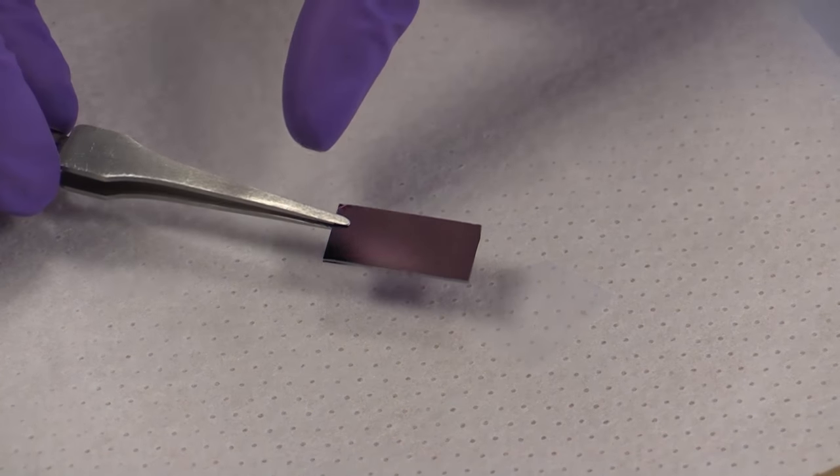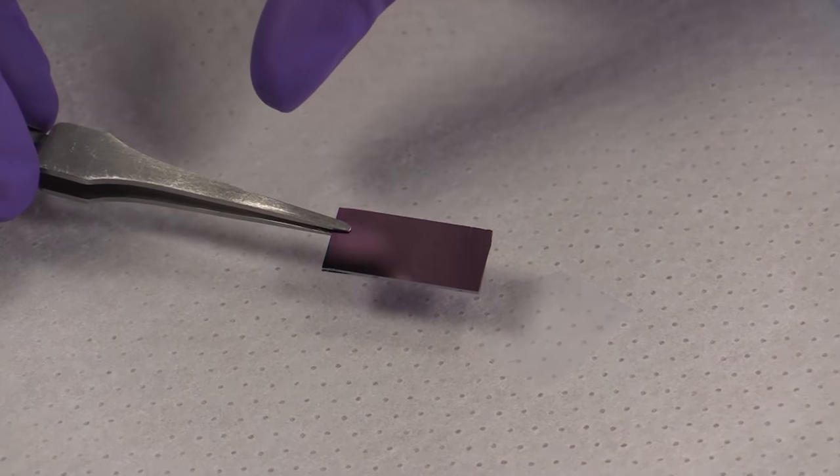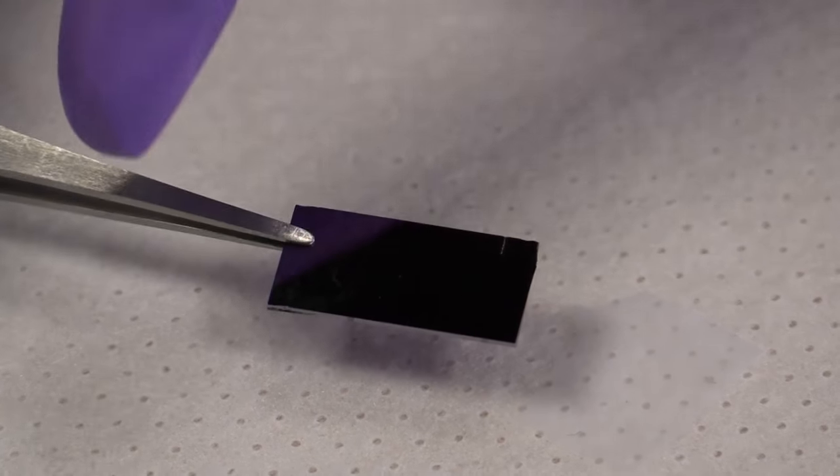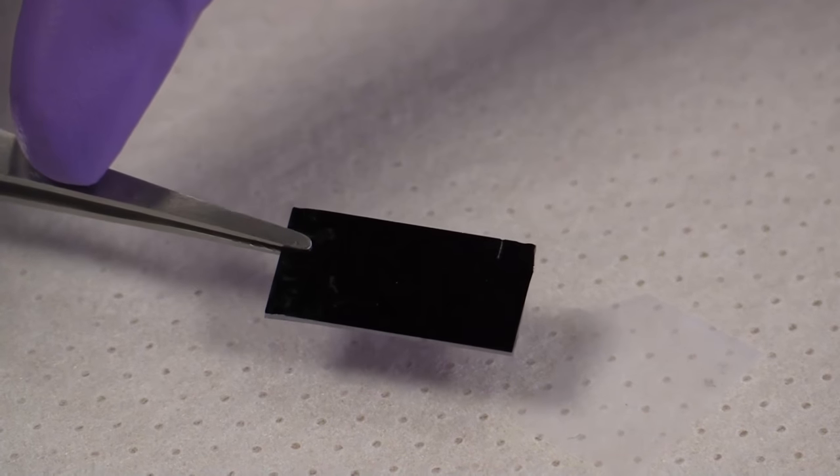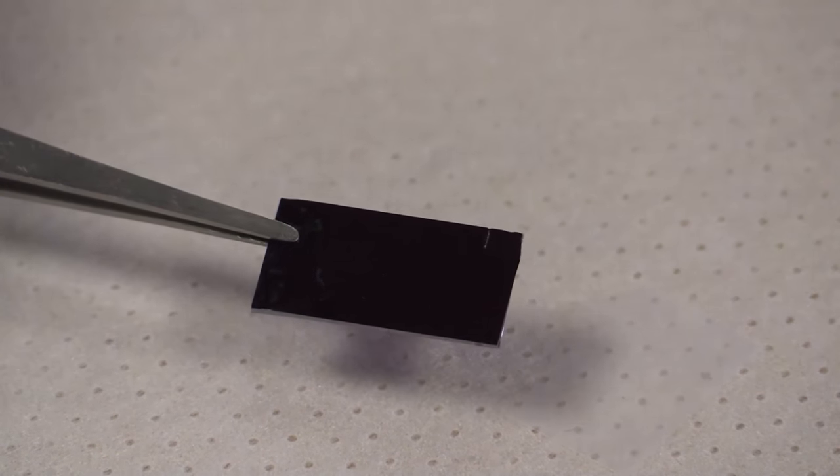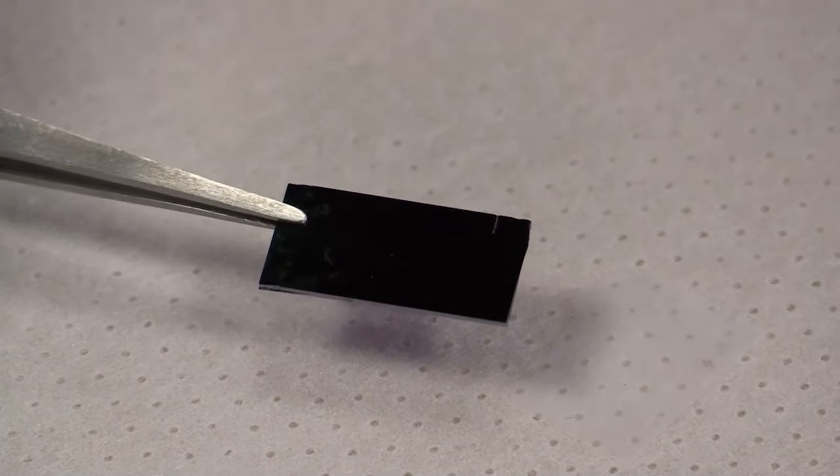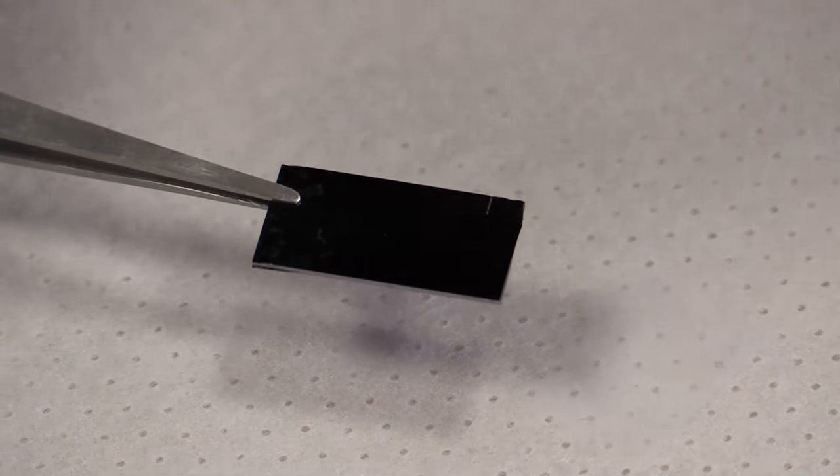On the right side here, or your left, we can see the discoloration that is indicative of monolayer growth. And now we're going to go to the microscope and take a quick look.